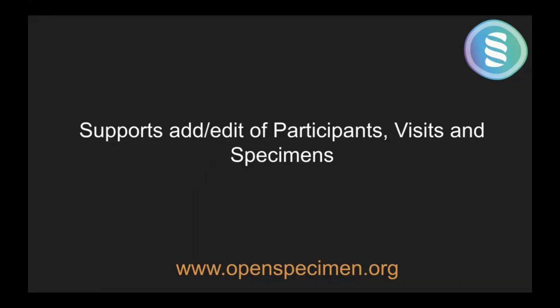We also now support adding, even though we call them specimen workflows, your starting point can be registering participants, registering multiple participants at a time, and then collecting the visits for them and collecting the specimens. Or participants may already be registered, but now we want to create visits for them and then collect specimens. So the starting point can be anything now.